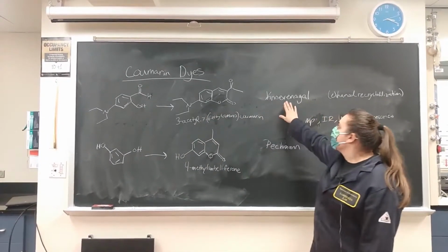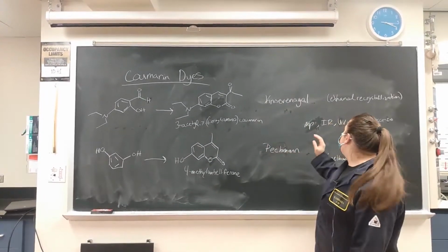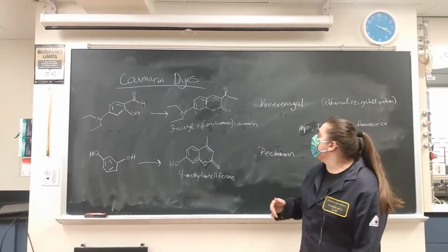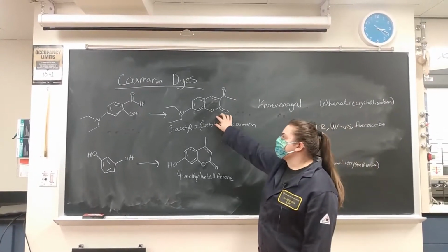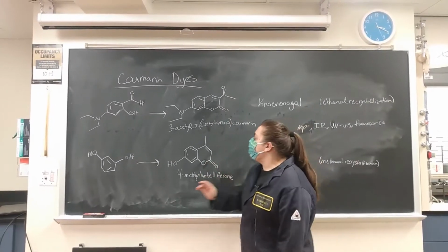So that's our Coumarin, and we're going to purify that product from ethanol by doing a recrystallization. And that should be able to give us this clean product, and it's very fluorescent, very bright colored.